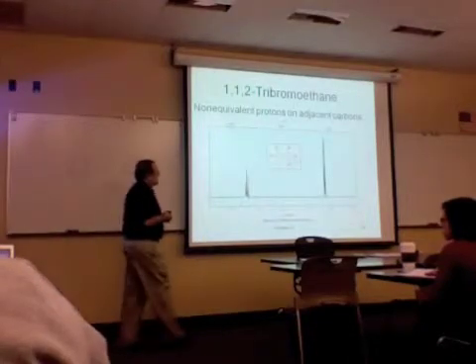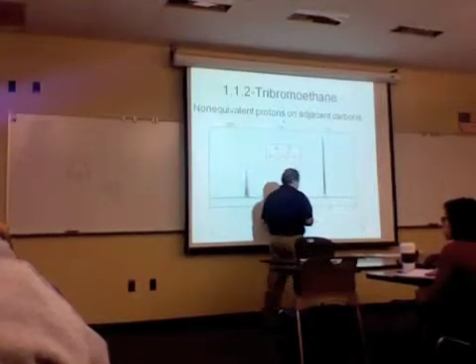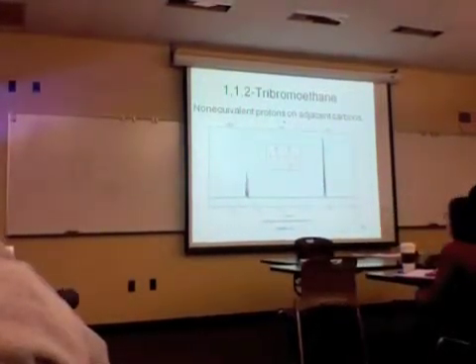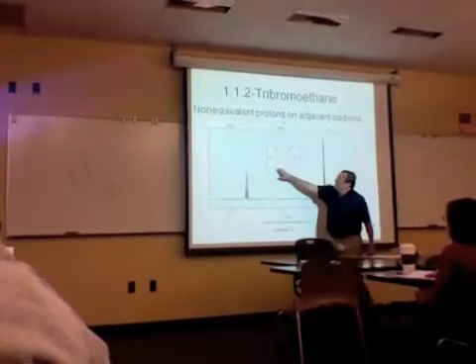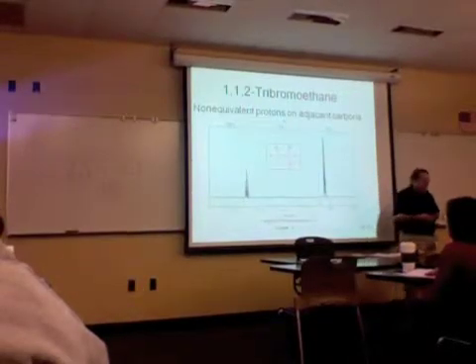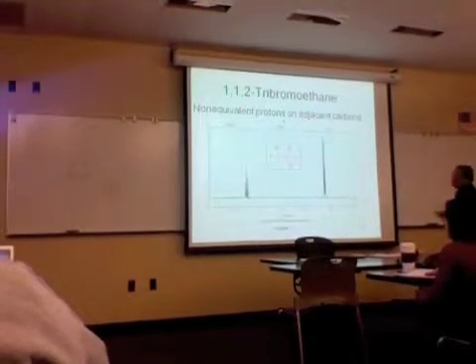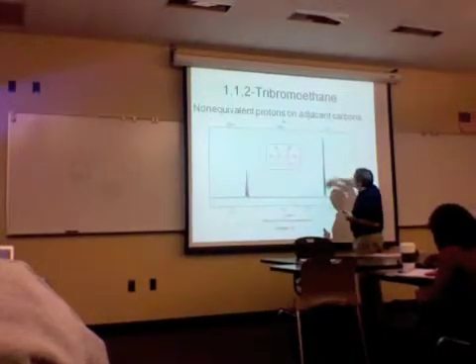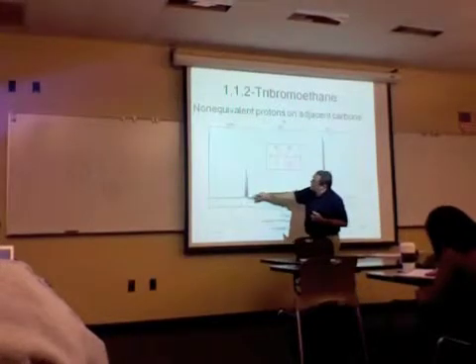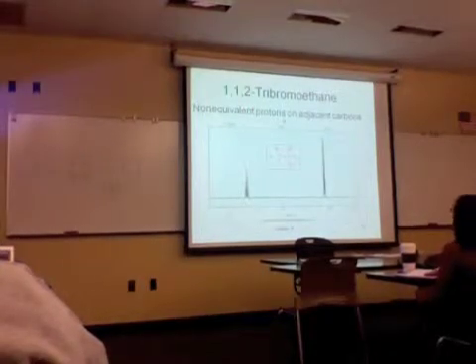So, look at this guy. This is a pretty good example. I've got a 2-carbon compound, and I've got 3 hydrogens here experiencing the magnetic field, and we've got a fair amount of downfield shift because of the bromines present. So we actually have good separation between the 2 kinds of hydrogen, type A and type B. But notice that they don't split cleanly into simple peaks. They appear as multiplets based on what's next door. Overall, the area under this doublet here should be twice the area under this triplet here. But what's of interest to us here is the splitting pattern.